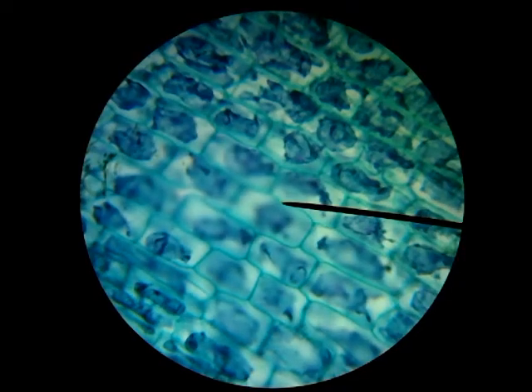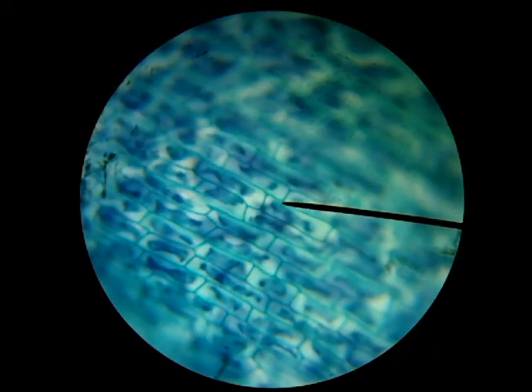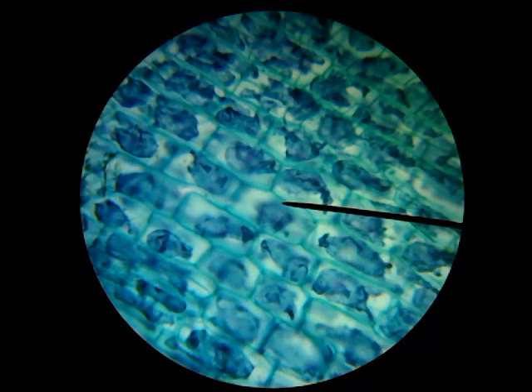Here's one view — changing the focus, there are some more cell walls. You're kind of seeing the top of them, and then as we go down through them you can see another layer underneath. So those are our plant cells for our elodie leaf.